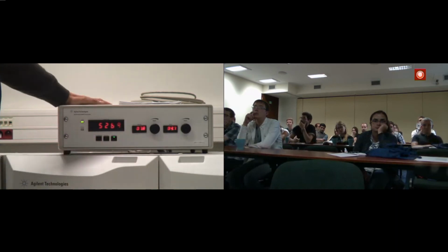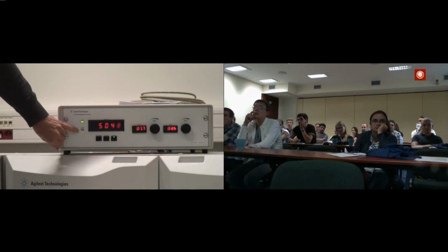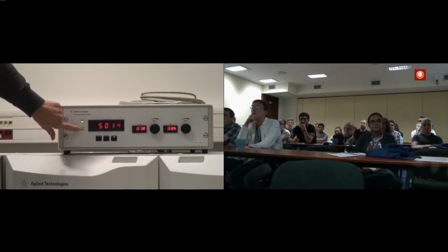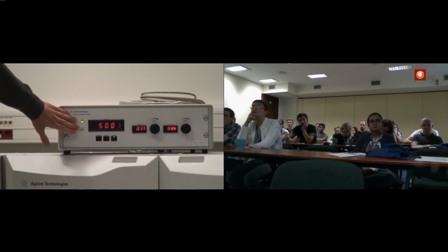And this box, it's clever enough to stabilize our rotation. So when the MAS controller is satisfied, then we are going to see this green light here. And that gives us a message that, okay, rotation is stable, rotation is locked, which means that there are fluctuations of the order plus minus 2 Hertz. And probably in a second we are going to see this. So now the system is fine.